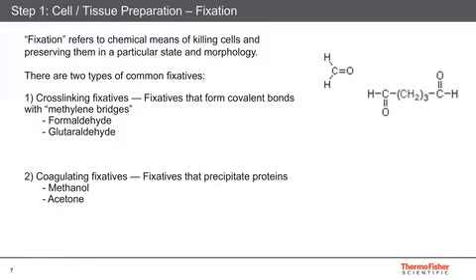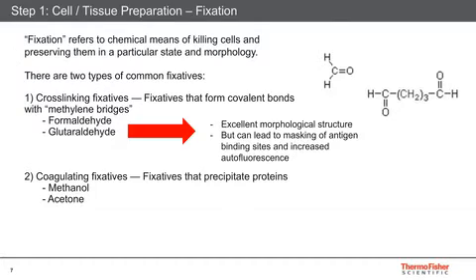Next, and we're talking mainly here in this webinar about fixed cell systems like antibody labeling. What does fixation mean? Well, fixation means that you're doing a chemical treatment to preserve the cells in a particular physiological state and to preserve morphology in many cases. The main way that people do that is either through cross-linking with aldehydes or through solvent fixation. Cross-linking with formaldehyde or glutaraldehyde really preserves the structure by cross-linking proteins, the amine groups on these proteins, which creates a rigidity to the cells or tissue, preserving them in that state.